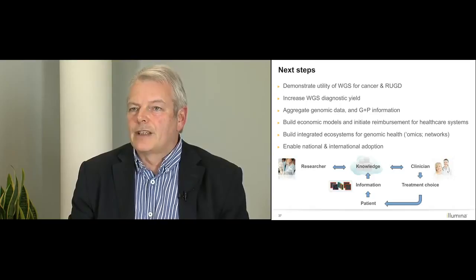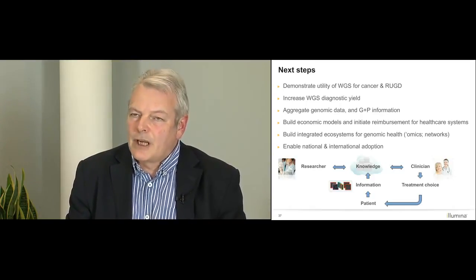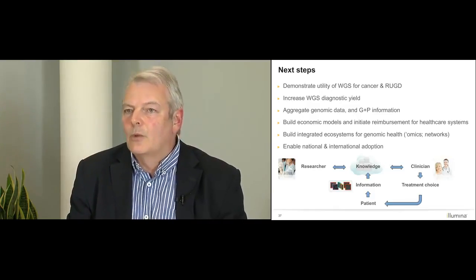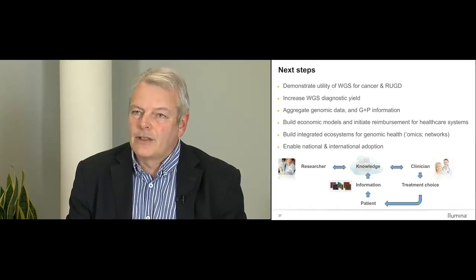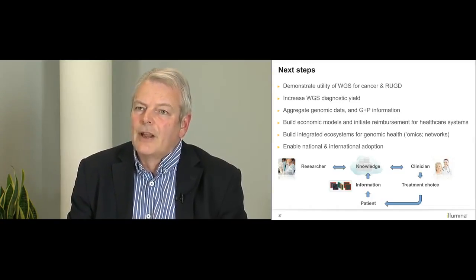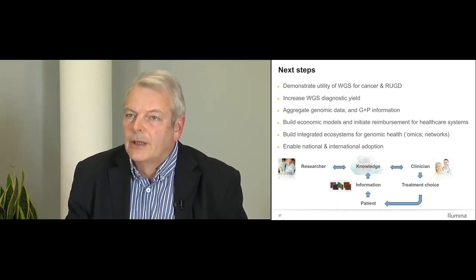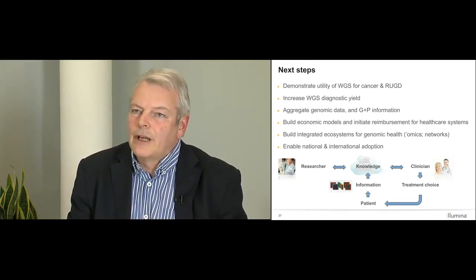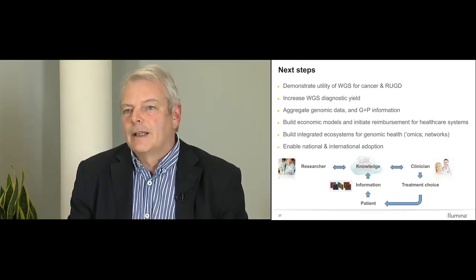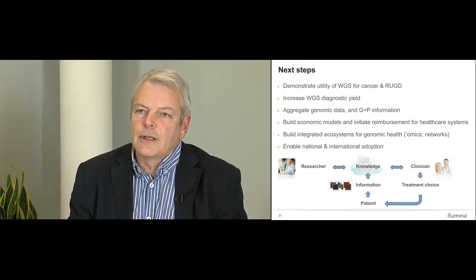But suffice to say, some of the benefits of the whole genome sequence, despite the size of the data, which I hope I've talked to you a little bit about, and the technical challenges, is that actually it's a very simple workflow and it really is one test fits all. And we are confident that the whole genome sequencing approach really is the way to a very high diagnostic yield. Once you have all the information, you can interpret it. If you only go for some of the information, you don't know if the answer is in that information or not. And that's why I put forward a simple philosophy for whole genome sequencing.